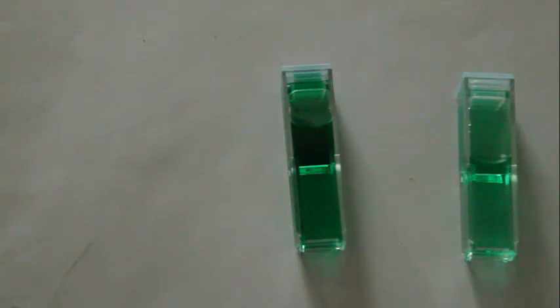That suggests that there is a relationship between the amount of light transmitted and the concentration of the dye.